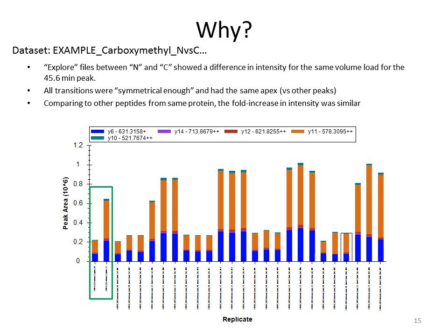Isn't that an assumption that it's going to be different from normal? It is. Well, we weren't told anything, but then when we went back, they're like, yeah, that should be more. I mean, that's the whole point, right? You don't want to detect something that's disappearing to have it be diagnostic, because not detecting something doesn't mean it's not there. It just means you can't detect it. And so ideally you would like something that's increasing to show presence of a disease or a condition or whatever. And then we lucked out with that one.